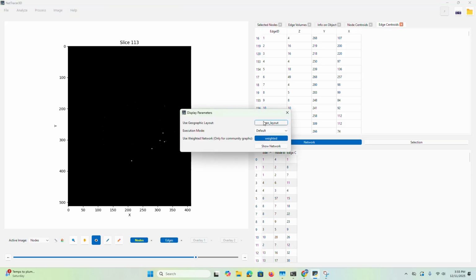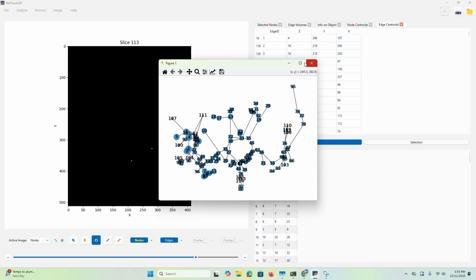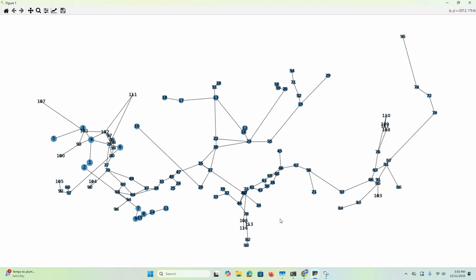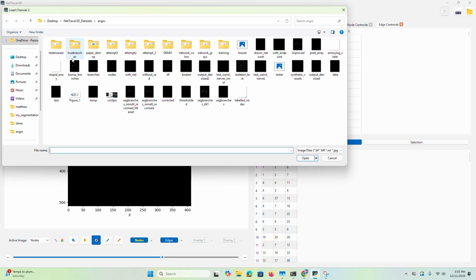So when we take a look at the network, human cranial vessels here, you can kind of see them here. Here's the circle of Willis, the middle cerebral arteries on either side. That's actually connecting the vertices of the branches. So it's one way to do it. You can also connect the branches themselves, which might be a little bit more intuitive.